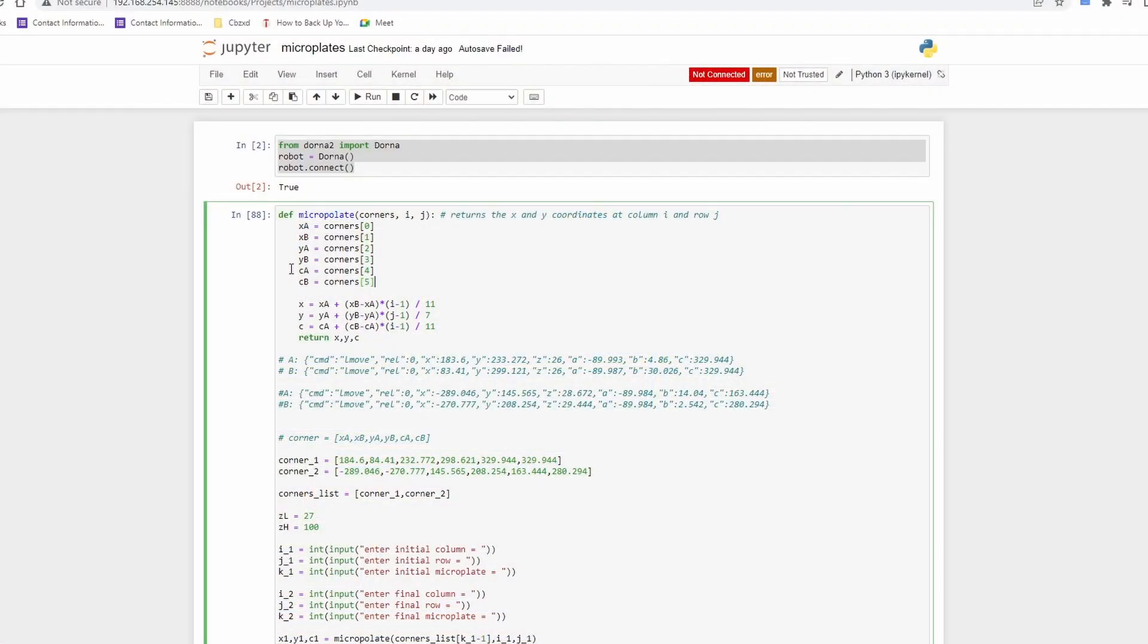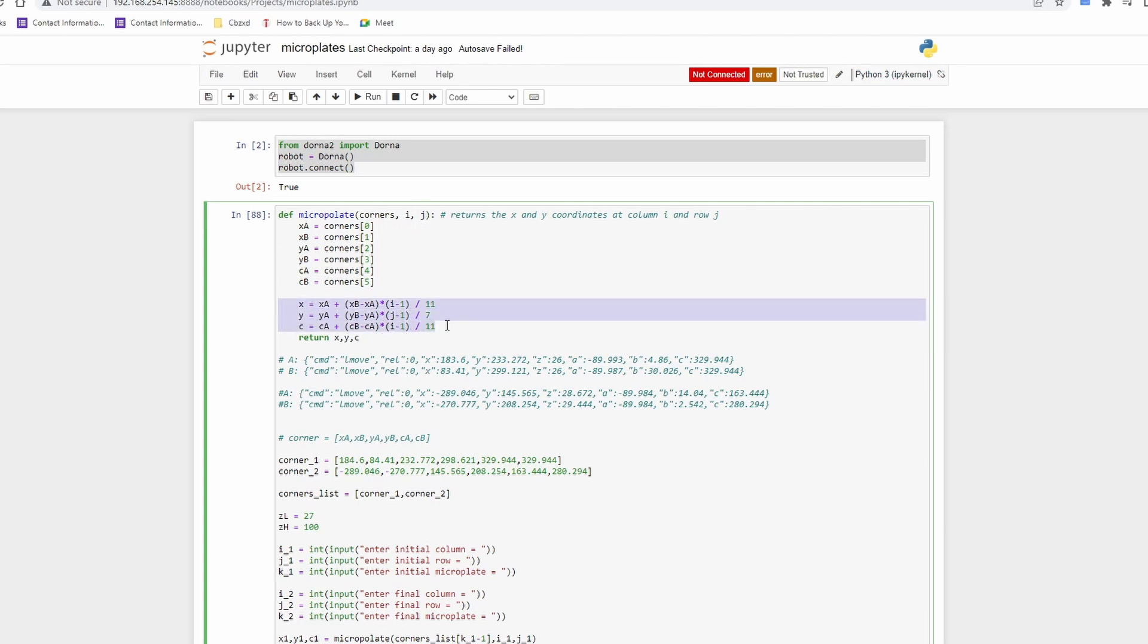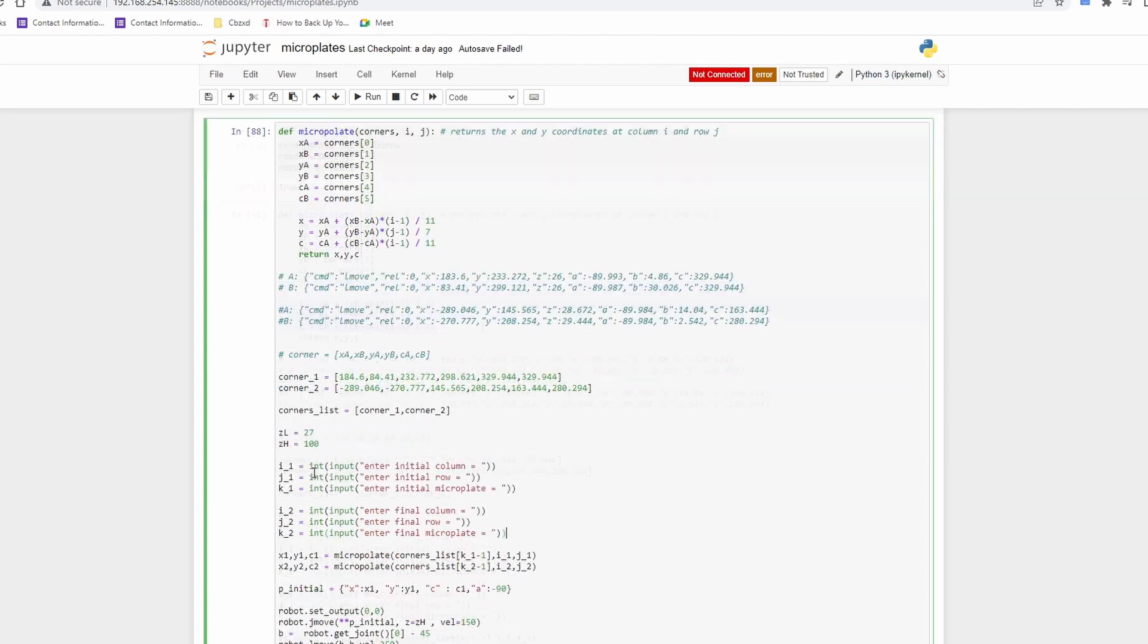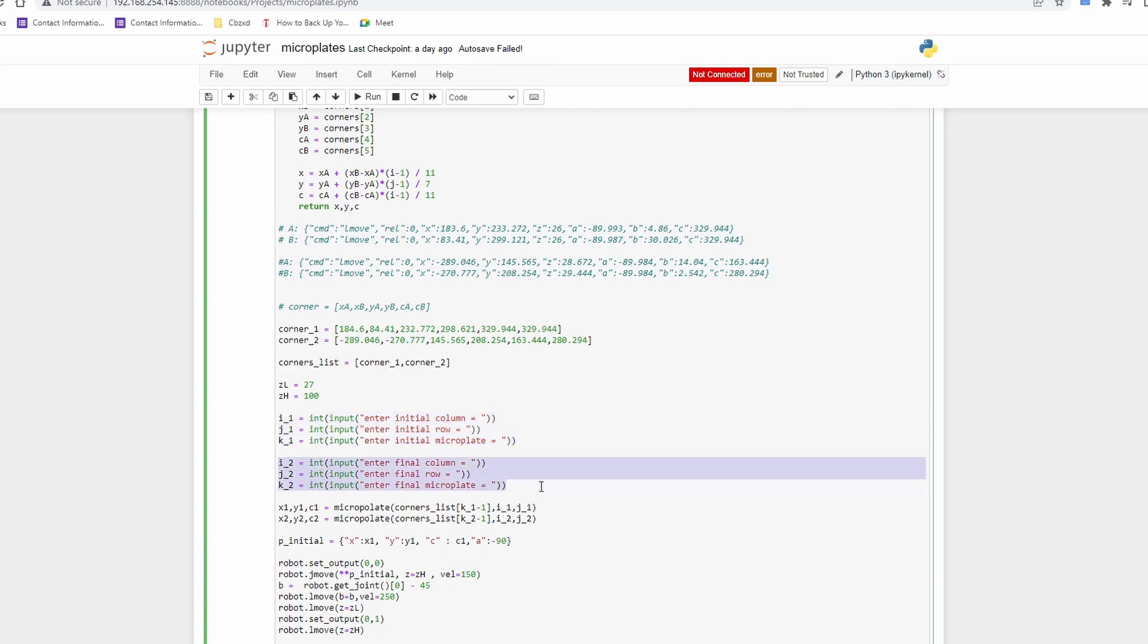This is the interpolation function. It gets the corner positions of the microplate and the row and the column number of the desired microtube and applies a linear interpolation to find the location of the desired microtube. Here we get the indices of the initial and final microtubes from the user and find their respective positions by calling the interpolation function.